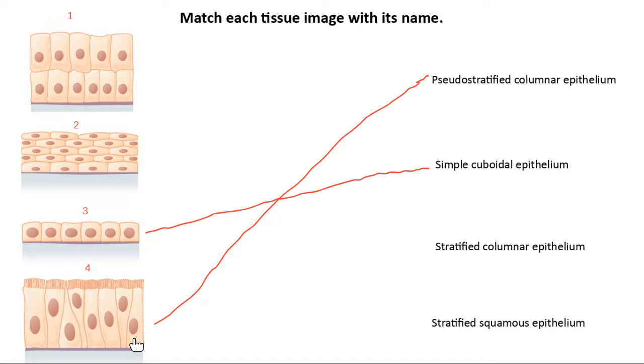Oh, I like it. Tien mentioned that when we talk about these pseudo stratified columnar epithelium, they kind of look like those blow-up dancing things that they put out in front of stores, right, or car dealerships. Although my favorite, I guess pre-pandemic, whenever I was driving around, the place that I saw those blow-up things the most was e-cigarette stores. I feel like I was always seeing those wavy guys. Yeah, the wavy arm guys. I love it. Yeah, mattress stores. So random places where they're really hoping that a dancing balloon is going to make you come. My dancing balloons, those pseudo stratified columnar epithelium.